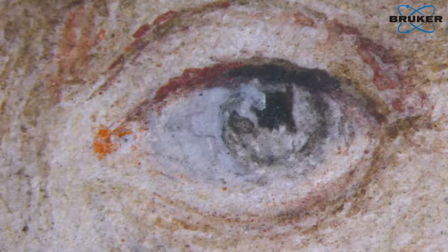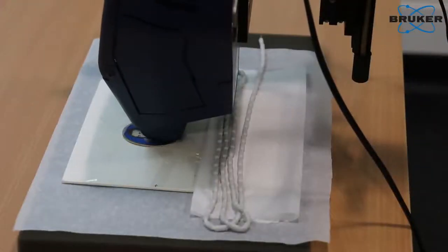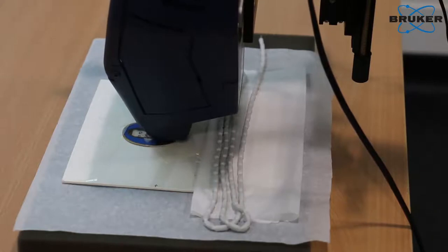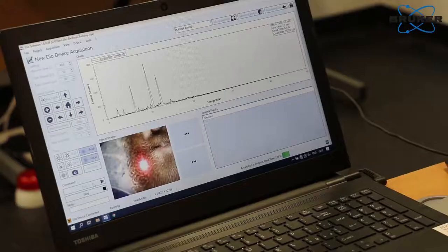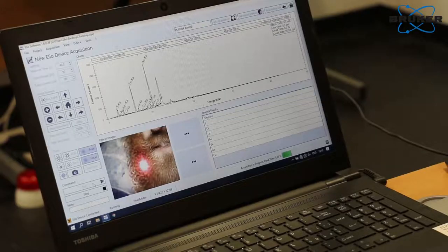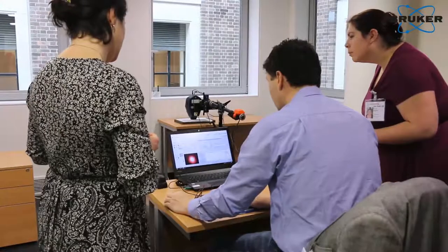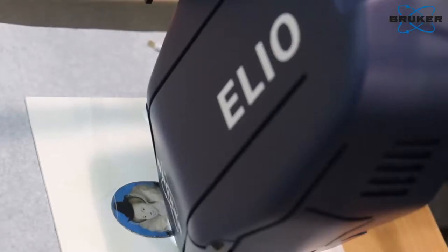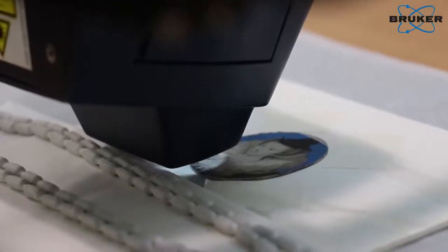We've been using a range of spectroscopic methods to investigate the materials composition of the miniatures, specifically the pigments used by the artist. One of the methods we've been using a lot is XRF — X-ray Fluorescent Spectroscopy — which gives the elemental composition of the pigments. What we're doing today with the Bruker is performing an XRF scan, which means we get an XRF spectrum at every single point on the miniature, about every millimetre or so.